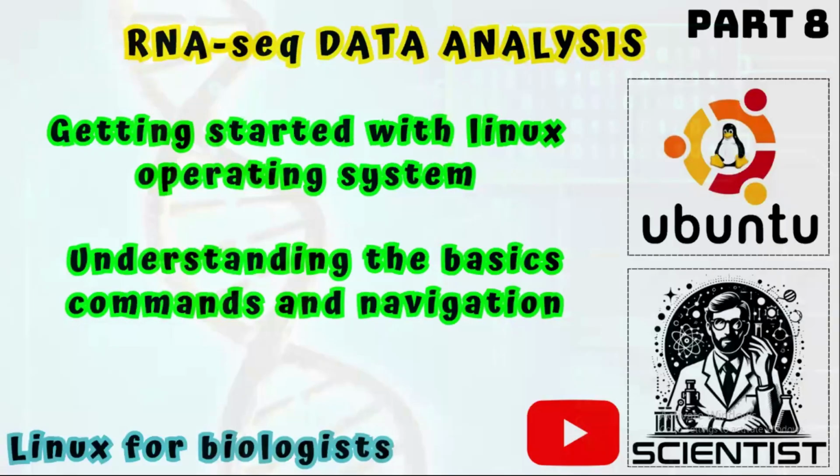This video is very important for biologists because I am also a bioinformatics student, and I know what type of concepts a biologist needs to understand Linux operating system. Basically, I will be explaining it in the context of RNA sequencing data analysis, because this is an important part of it. Most of the data that we have generated through sequencing, that is in the form of FASTQ files, will be processed through Linux operating system.